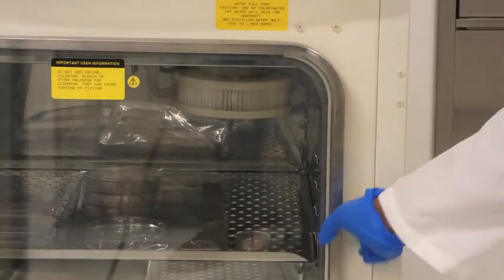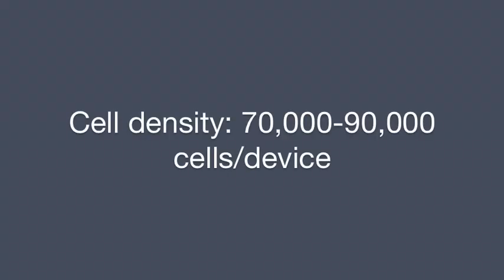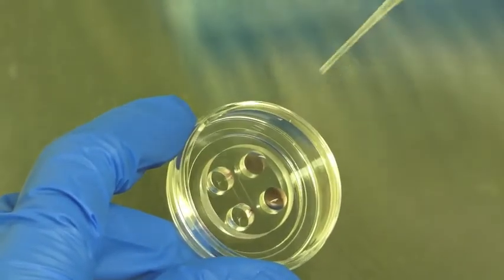Prepare a cell suspension of dissociated rat neurons according to established protocols. Aspirate the majority of media from each well of the device, but leave the channels filled.